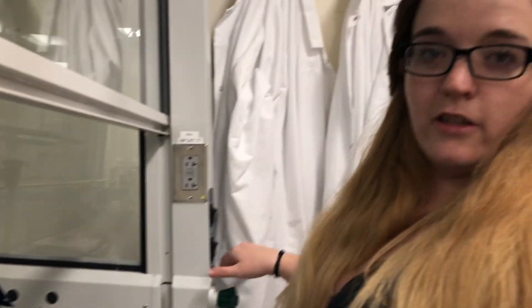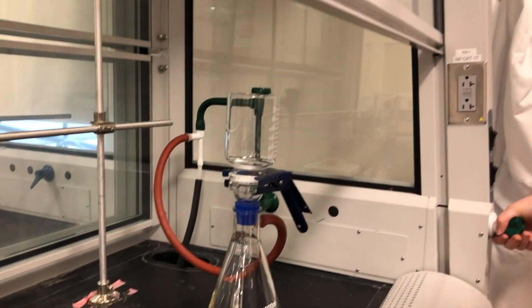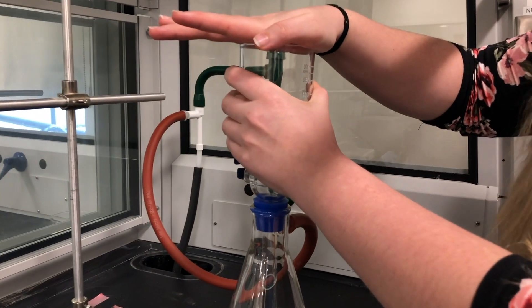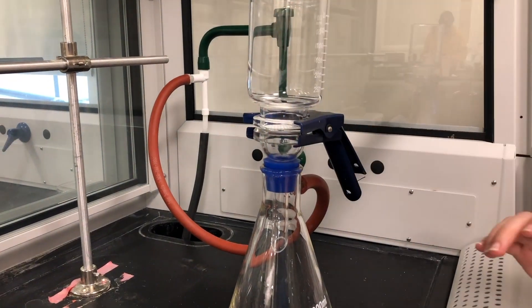Then you're going to turn on the hose and just test to make sure you're getting a vacuum seal — which is good.